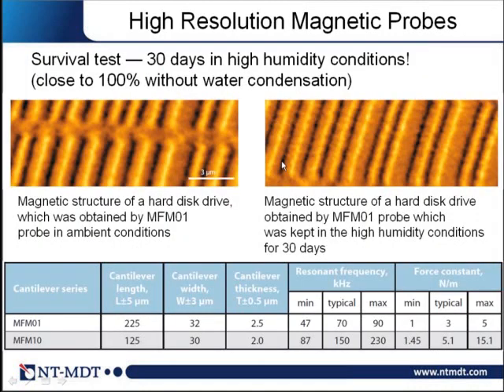Another important feature is high resolution. As I said, magnetic force microscopy cannot obtain the resolution which people obtain using atomic force microscopy. But nevertheless, there are several approaches which allow you to produce rather high resolution.